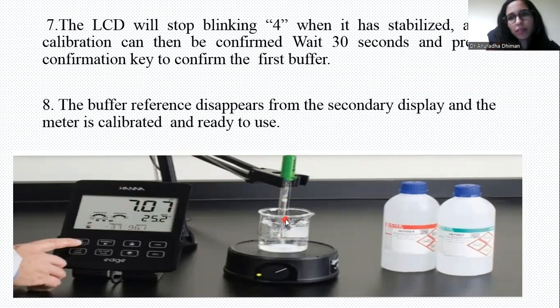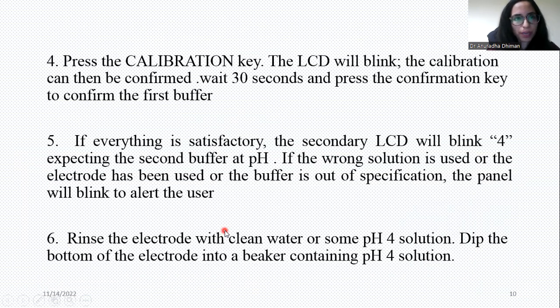Have you ever seen a pH meter in the lab? Generally, they put the knob into some solution. The solution, generally, we take a buffer. Fine. Buffer tablets are easily available in the market. We need to take that buffer tablet and make the buffer solution. You can see the bottle, they are for the buffer only. We need to use the same. Fine. Okay. Now we will discuss calibration of the pH meter.